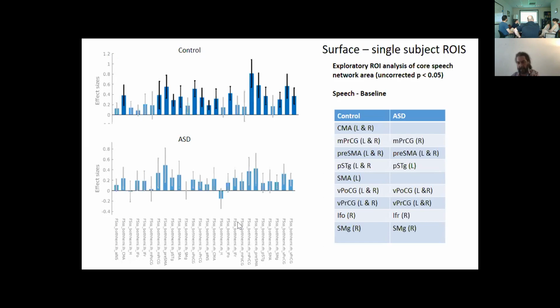So I can just add a little thing to the code, so that when you have a single ROI file, it doesn't necessarily add the portion of the file name or the ROI name to the labels, so that you don't have to add that manually also when you enter the groups or anything like that.